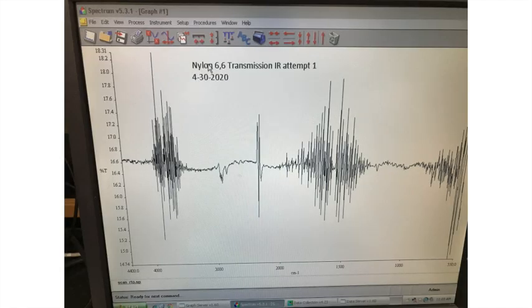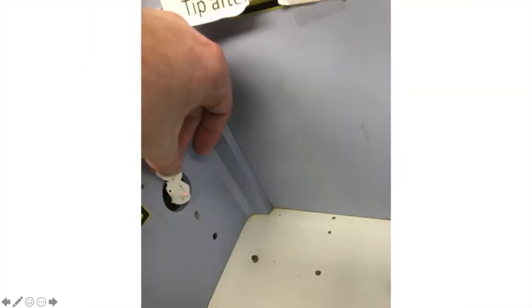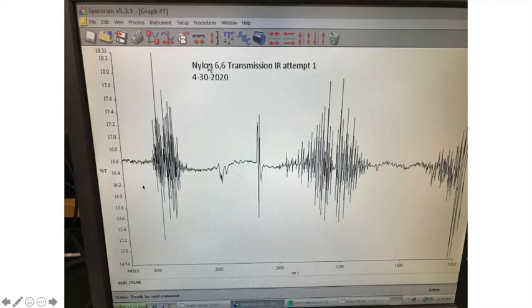Here's how it looks. Not very good. So that clump, if I go back, the clump of nylon's pretty thick. If it's too thick, it doesn't let enough IR light through it. It's not thin enough. But I can still see some stuff happening here. A little less than 3,000, some alkane sp3 carbon to hydrogens.